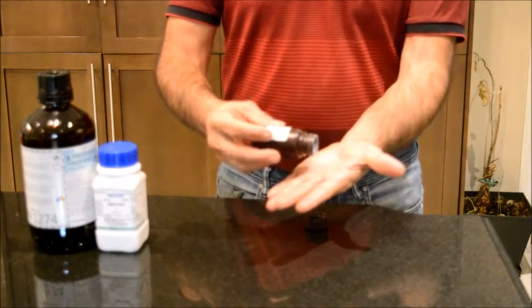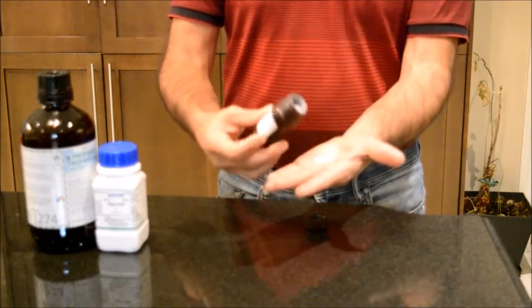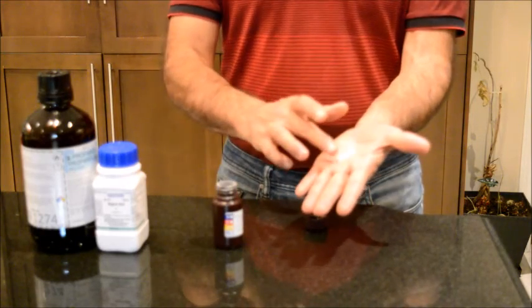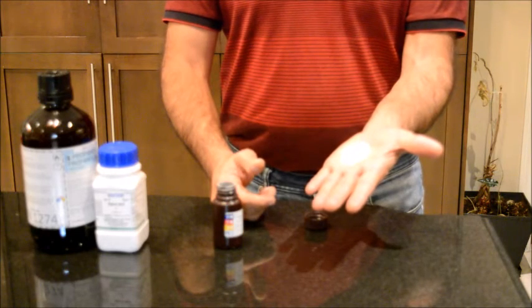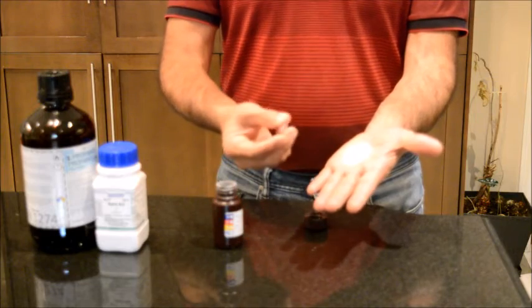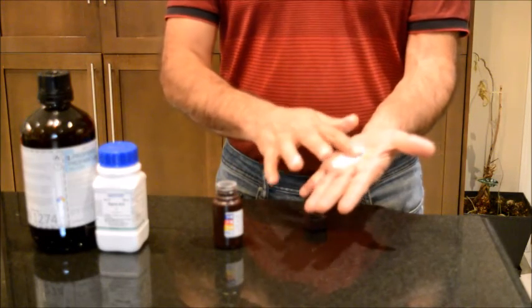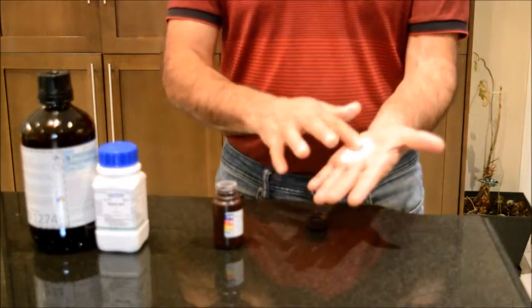Now I can pour a little bit of this stuff on my hand, and the material is a very fine powder, micronized even, extremely micronized, and has a very small particle size distribution, and when you touch it, it feels like you're touching a bar of soap. It is somehow greasy.